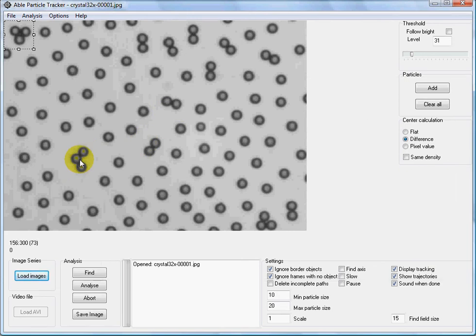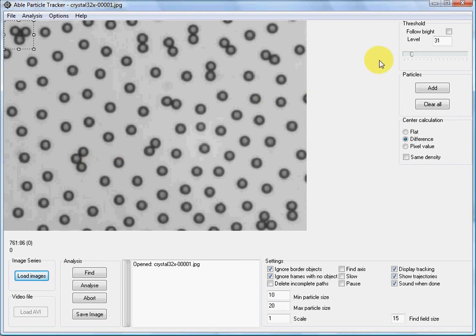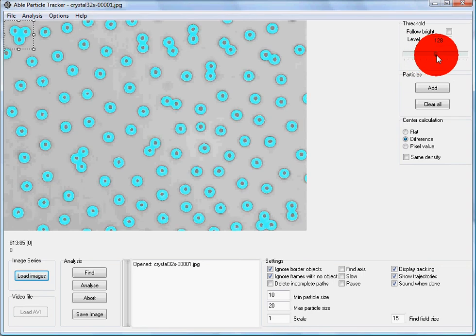Let us decide that we want to track only single particles. First, let's select the proper threshold level using this slider.